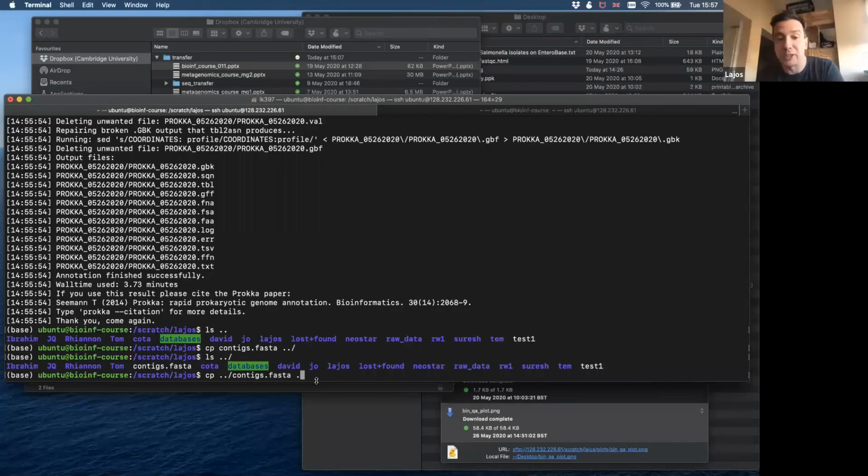Okay, so if I go back to my previous tale about those isolates that are phenotypically different from the others, then probably, especially if we are speaking about prokaryotic genomes, you have to look for extra genes, which are also called the accessory genome, the genes that are out of the core genome. But this is again something you can do with PROKKA annotation. You just have to use the next proper tool.